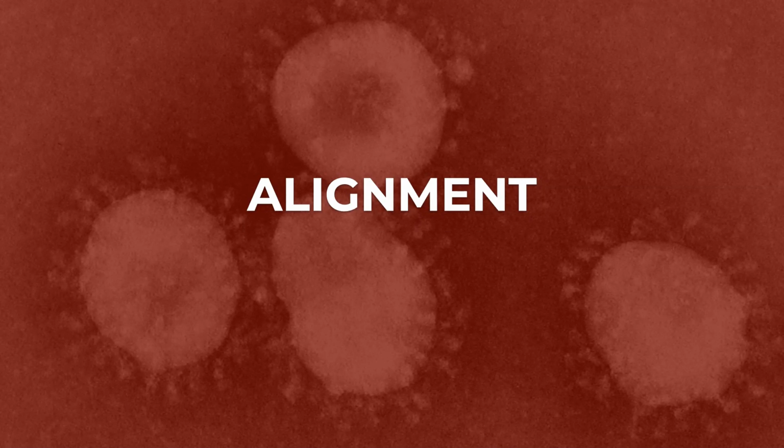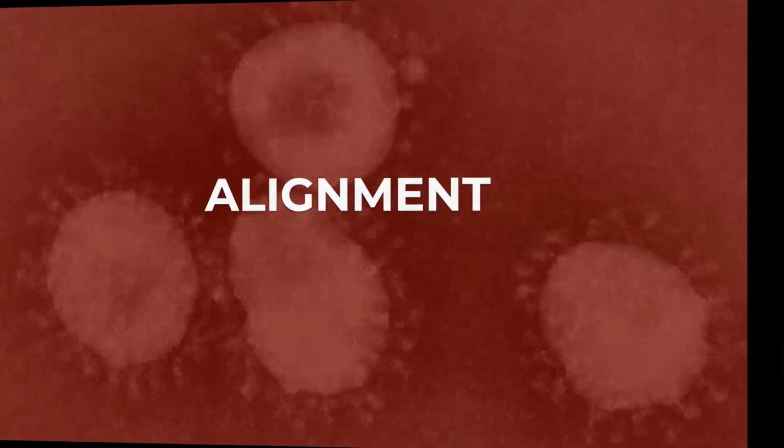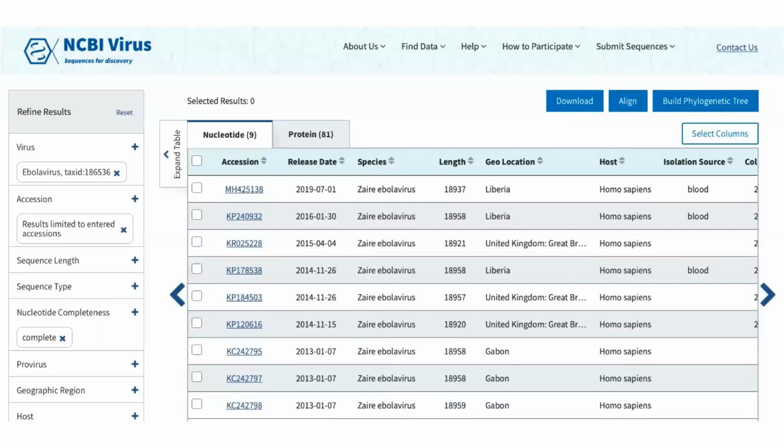In fact, I will show you today how you can do it in a matter of minutes, all of us together on NCBI. So freely used software, you don't need anything else, based on assembled genomes. To do that, let's go to NCBI Virus and select a certain number of sequences. Just before I switch over to NCBI, I'm going to give you those specific sequences that we would like to select. These are going to be accession numbers.